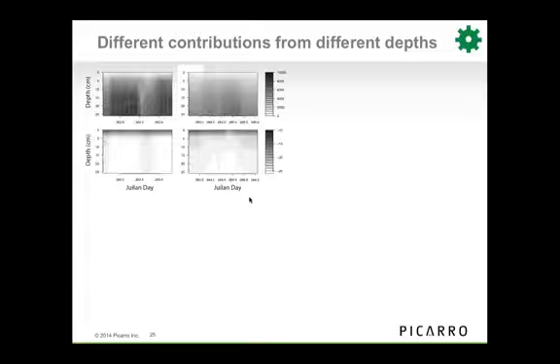And the way we did this was by burying tubes in the soil. These tubes were perforated and covered over with a hydrophobic membrane. We attached the Picarro to one side of the tube and just let it draw air out of the tube for about 15 minutes to get a good idea of what the CO2 and the delta 13C ratios were. What you're seeing on the top plot here is the soil concentration during that study period.